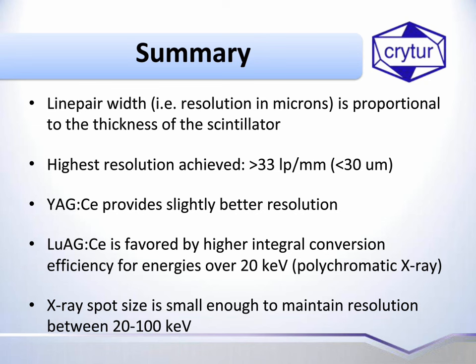Well, may I add something? Yes, please. Okay, so you can actually couple the scintillator just by pressing it on the top of the fiber optics of the camera using some liquid or something like that, or you can use a fiber optic plate glued to a scintillator and then press it against the fiber optic input. We actually confirmed that these two options will give you the same resolution. The FOP, which is added to the system, will not have a measurable effect on the resolution of the system.